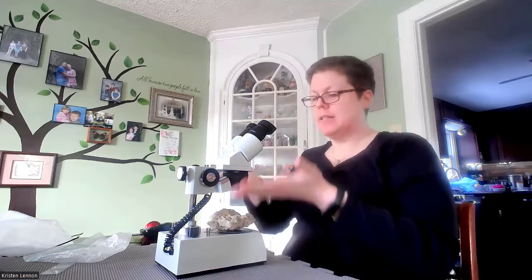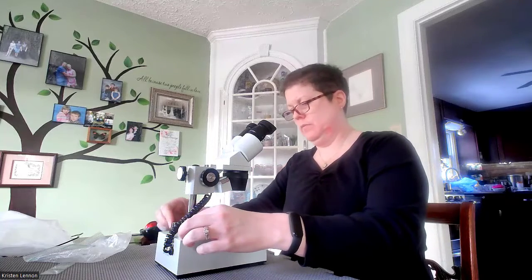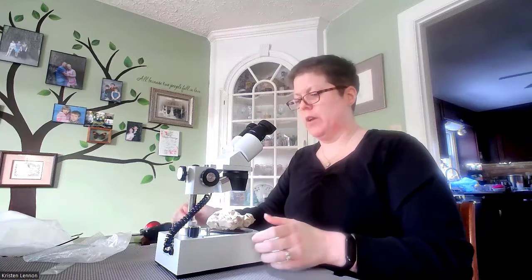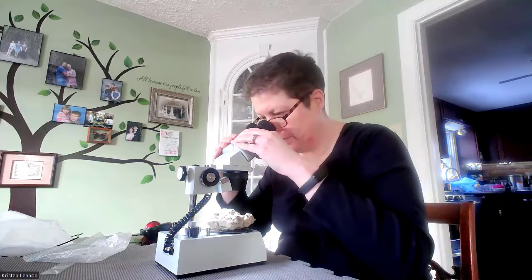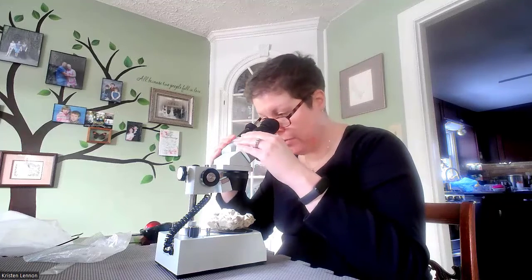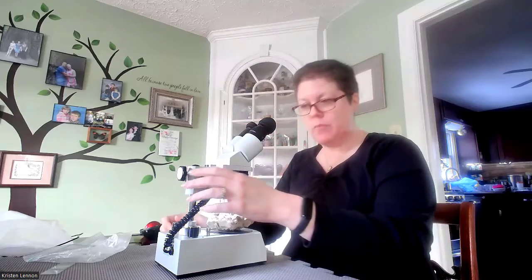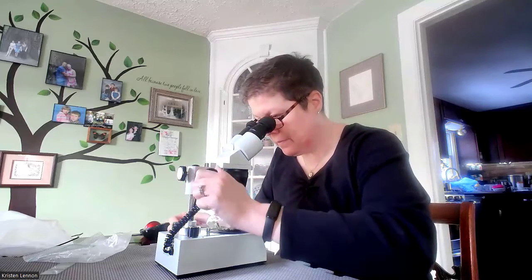All right, so we've got it set up as high as it will go. And this is going to tell us whether or not we can even use this microscope to view this fossil. Now we want to turn on the light. There we go. And you can look in, adjusting the microscope to fit your eyes. If you need help with that, you want to watch the introduction video on how to use the microscope. And then we're going to focus. Ooh, good news, we can focus on this fossil.